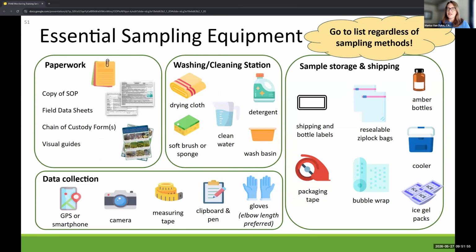All right, so here's some of the checklists to refer to for sampling equipment and supplies. This is the basic checklist that's recommended in our procedures. Much of what we spoke about, including cleaning materials, in addition to the health and safety materials as well.